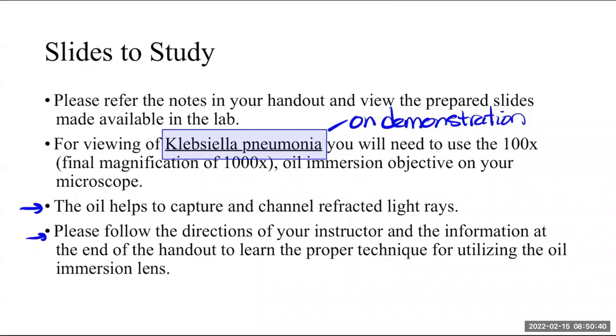We prefer that the oil immersion might not be used this particular lab, just because it is an extra level of complication and it makes the slides a mess. They're full of oil, and that means that it's difficult for people who come into the lab next, because they will have to use slides that have been affected by the actual use of the oil if they have not been properly cleaned.